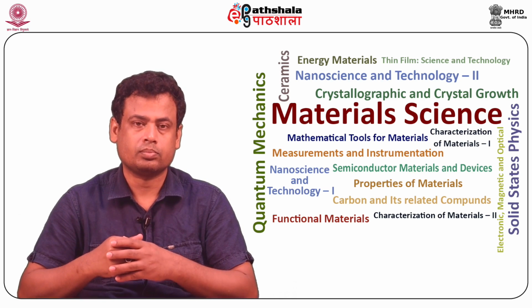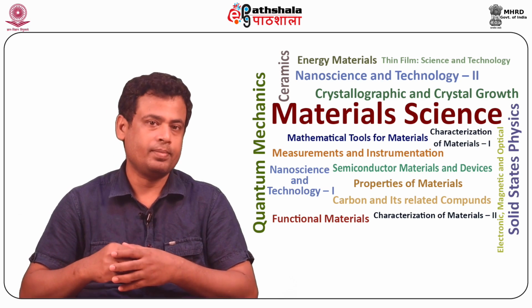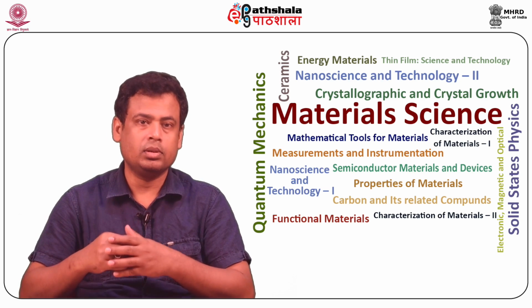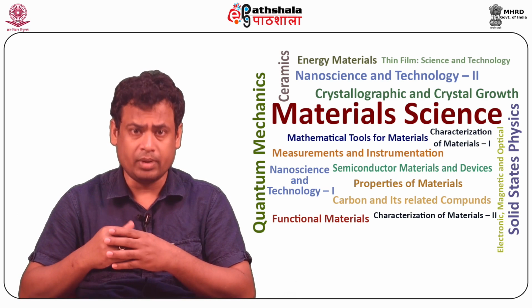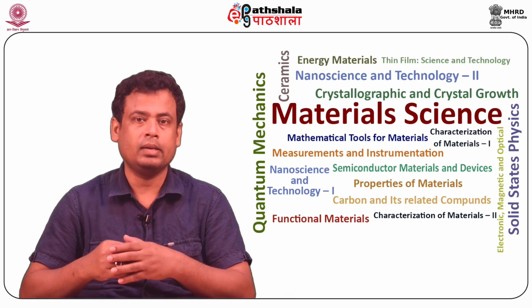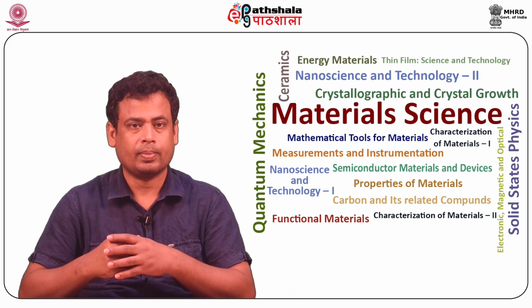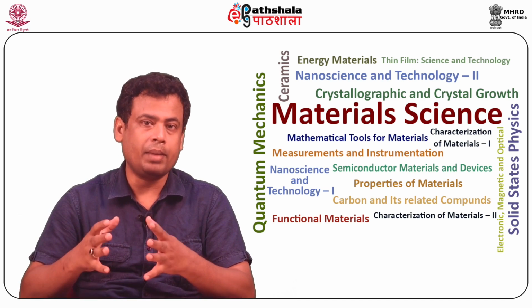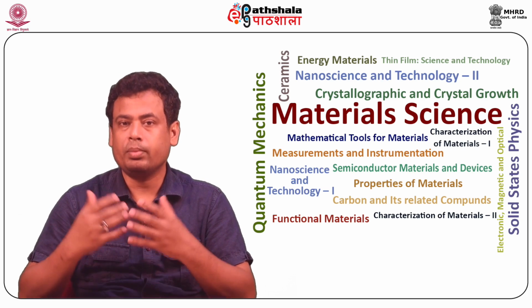So, students, let us summarize what we have learned in this module. In low voltage SEM, the image contrast results from changes in the secondary electron coefficient from different elements, and this effect is largest when the secondary electron yield is maximum, that is, at low beam energies.